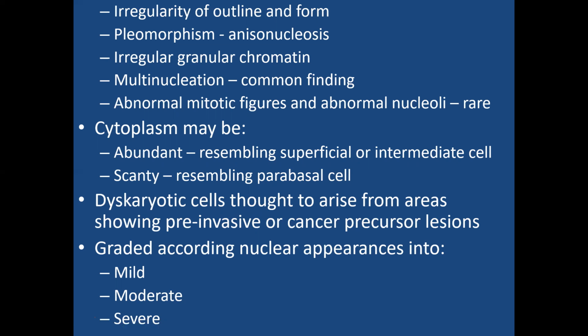So even though we showed you mild dysplasia, moderate dysplasia, and all that, that is histology. And in cytology, we cannot see the whole epithelium to be able to say this is one or the other. However, we would look at the type of cells we see in the different grades of the dysplasia, and we can use that to predict the underlying histological lesion. So that is it.